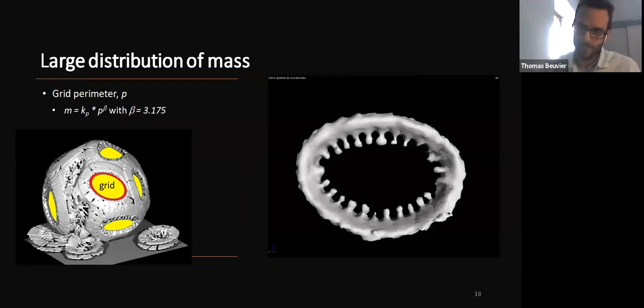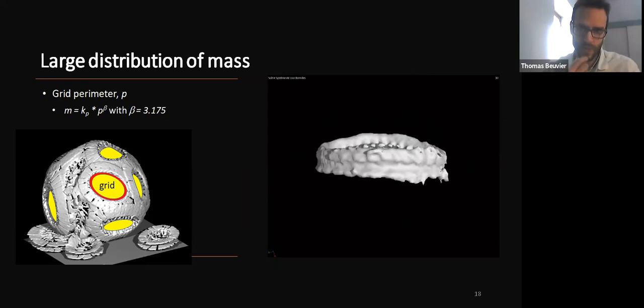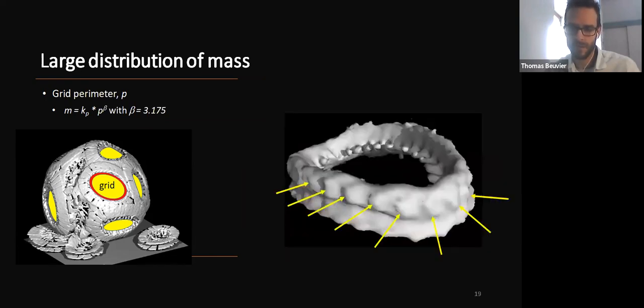If we extract, for example, this ring, we have a second piece of information: we observe that around this ring there is a periodicity, which corresponds to the beginning of the formation of the monocrystals of calcite.